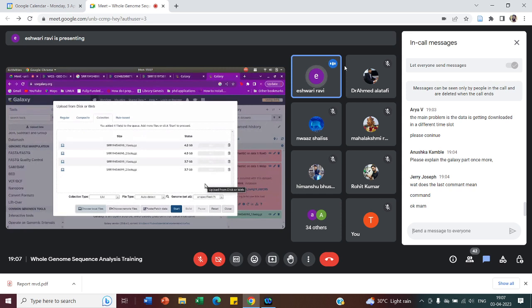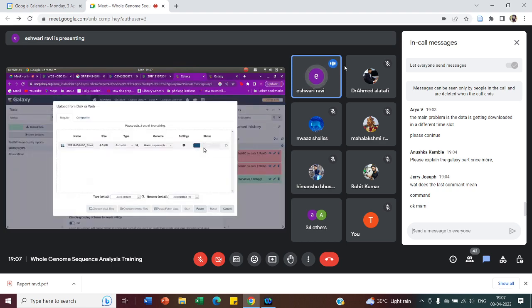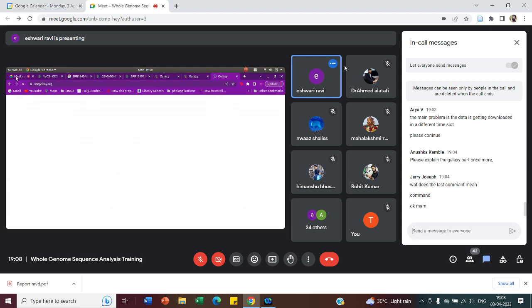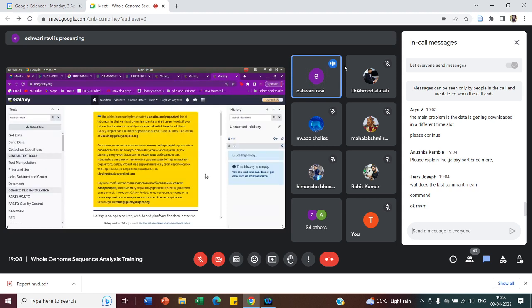So once it gets uploaded, I will have to click on start, and it will upload one by one. So it will give me the status. It's taking a while. Okay.